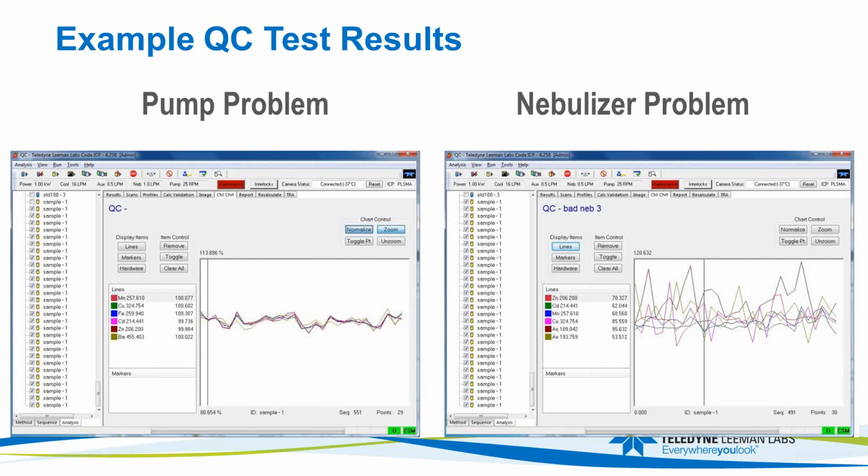Usually, if I think I have a roller problem, I just stick my finger on the pump and see if I can feel the drag going by. I can do that a bit more quickly than running this test, but that works. So that's another way to approach it.